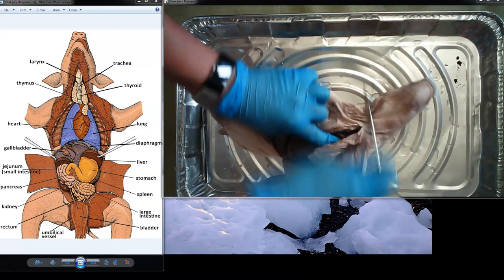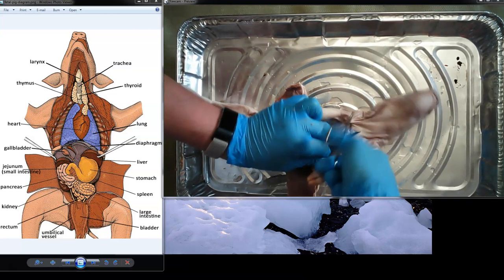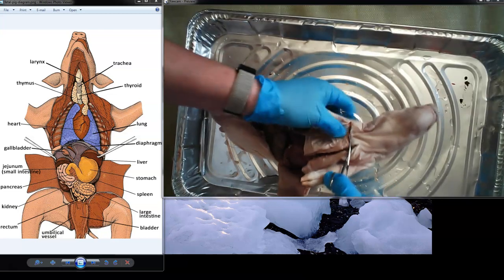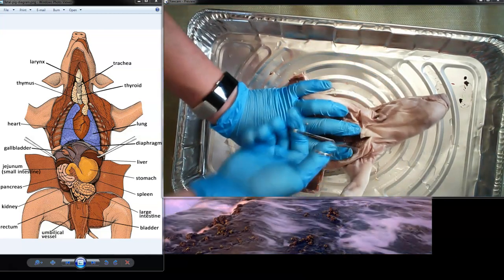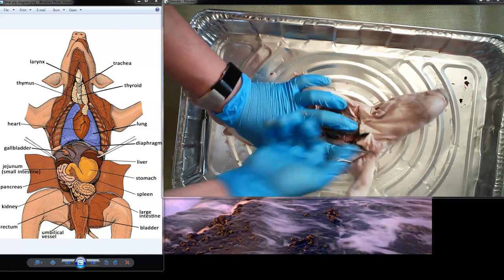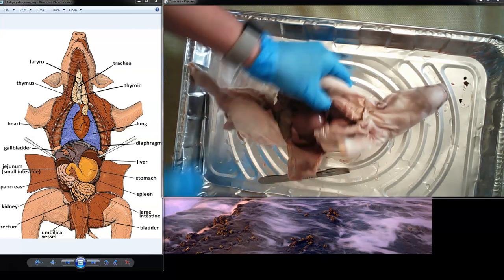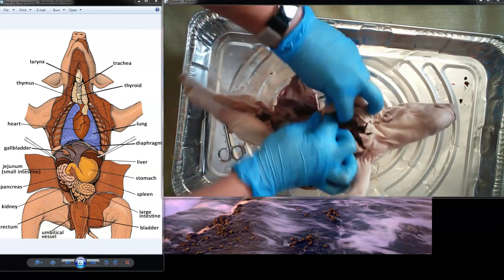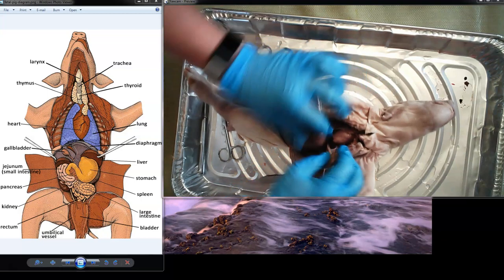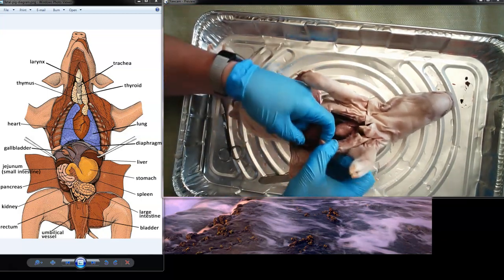Okay, let's go a little deeper. All right, everybody. I apologize that all you're doing is watching me cut into this pig. It's not really all that exciting for you. Not a lot of narration, but I just have to get this done. Okay. So now, I'm going to crack this open, and we are going to take a look at some really important objects. So I'm going to leave this side connected, and I've disconnected the other.